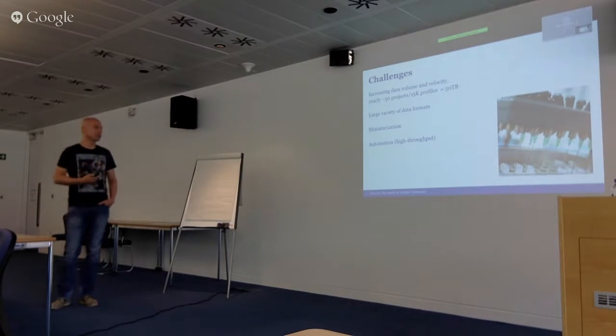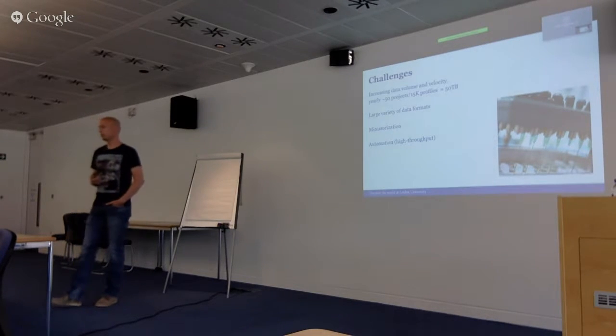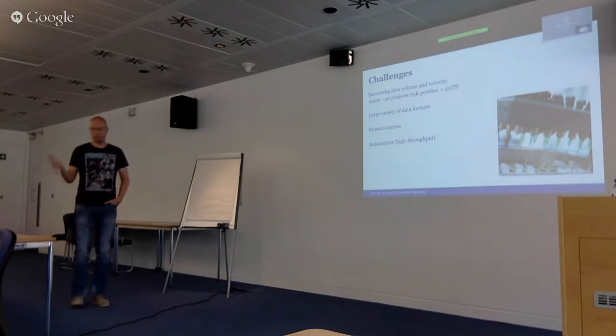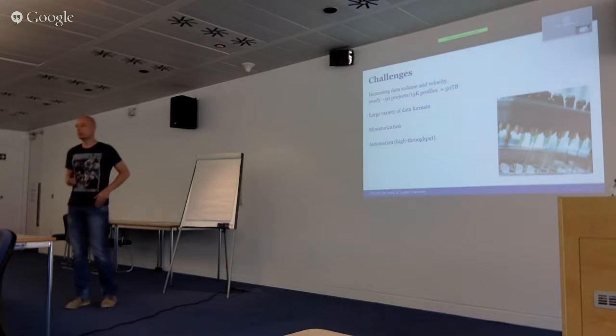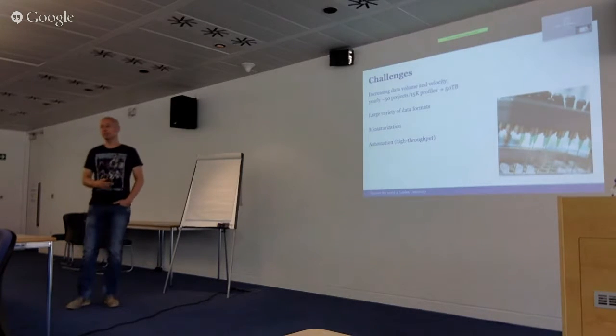But the challenge is to handle all the different large data varieties and have them comparable. Also, I have people coming to my desk and saying, well, I have this data coming from this Waters machine, which I want to look at in ProFinder or Agilent. And I think, well, that's not going to happen. Like, yeah, but I like that software better.